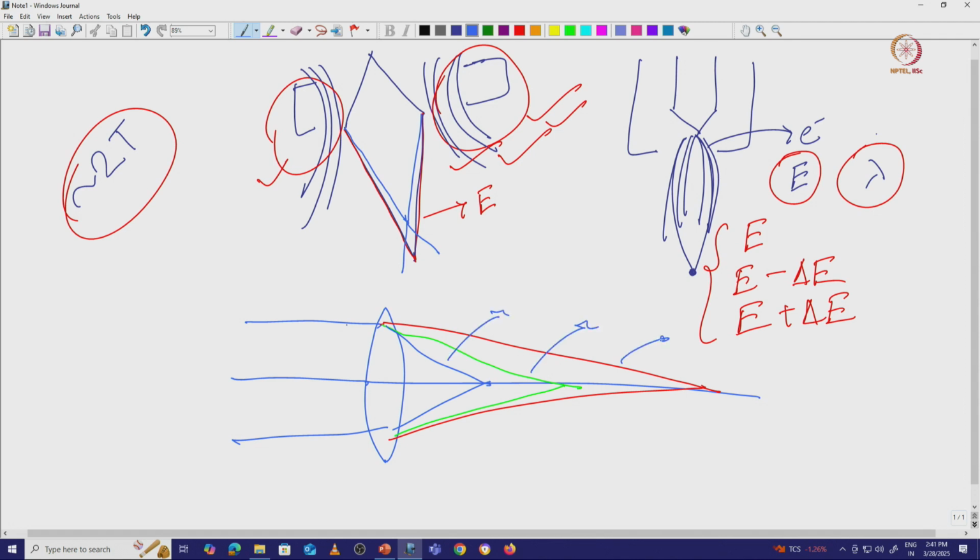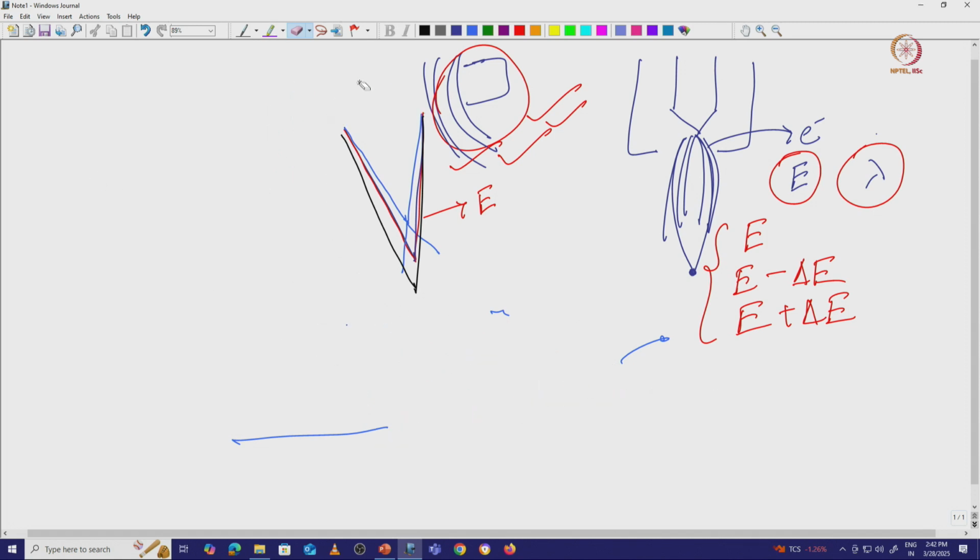Here also you cannot see a reddish, greenish or bluish appearance, but here, due to the energy difference, you have some kind of changes in the magnetic field. In one case you can see that the lines are converged somewhere here. So the similar pattern we can observe in this particular case also. Now if we want to draw it properly, we can get it like that.